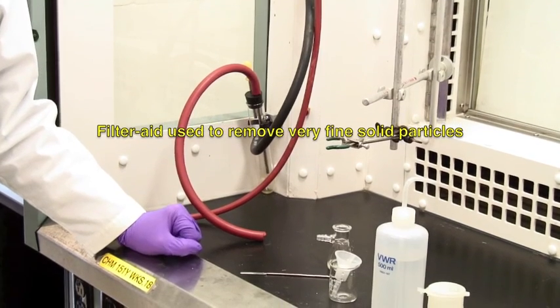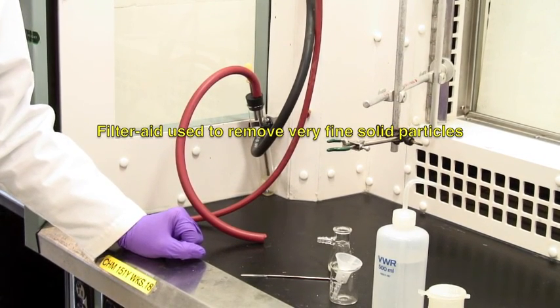You won't use filter aid very often, but you do need it when the solid impurities, which you want to get rid of, are very small.